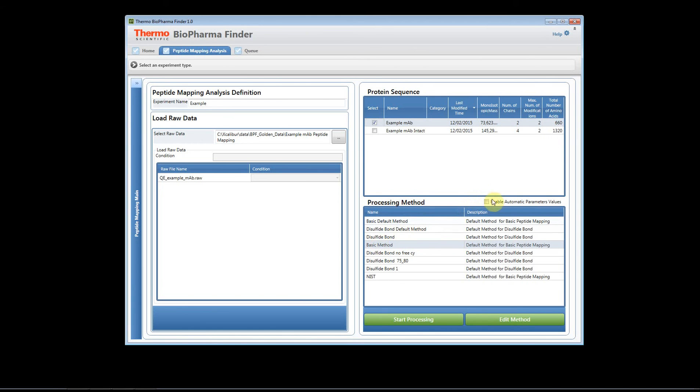If you do check this box the software will read the raw files and it may adjust those values.